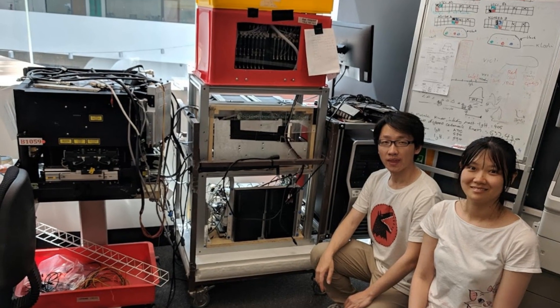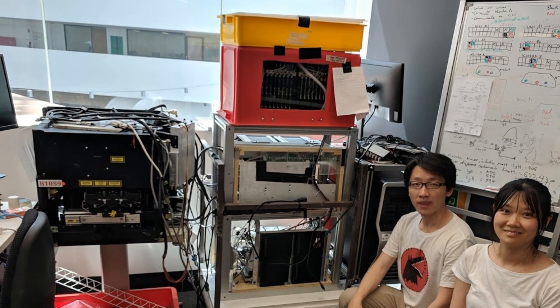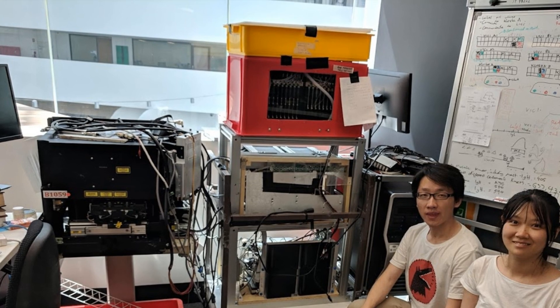I'm John Markham. I work as a researcher and bioinformatician in Melbourne at a cancer hospital. Part of my research involves a project in microfluidics looking at patient DNA in cancer. We were hoping to use the HiSeq both for its microfluidics to drive the chip that we're making, and we'd also ideally like to use the microscope to visualize what we've got on the chip.